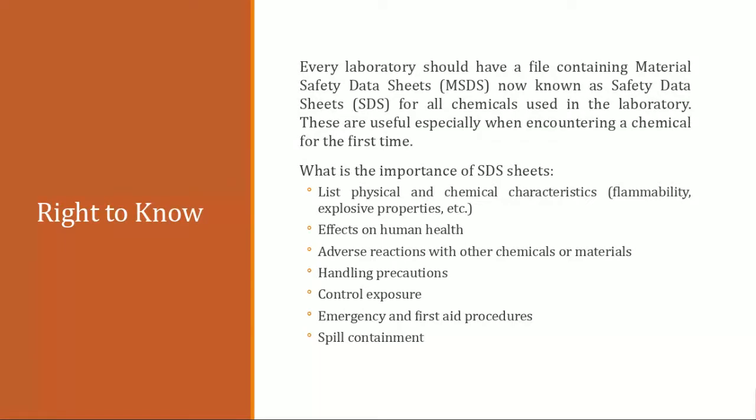That's why it's important for various health reasons. Not everybody in the world is identical. Some people might have allergic reactions. You might be pregnant. You might have other health conditions that make exposure to certain items in the lab cause an adverse reaction.